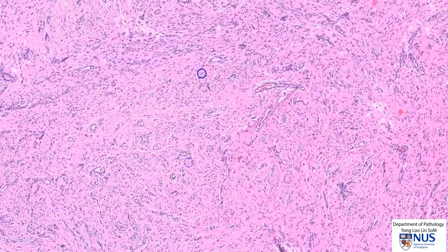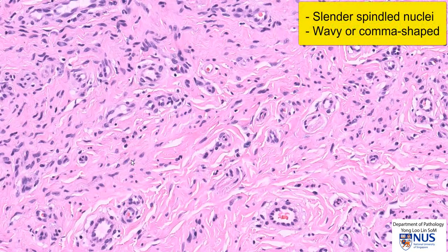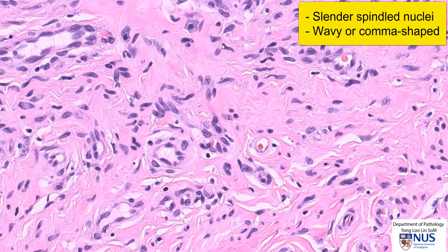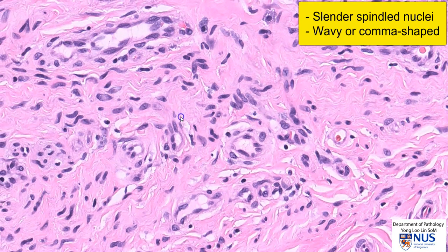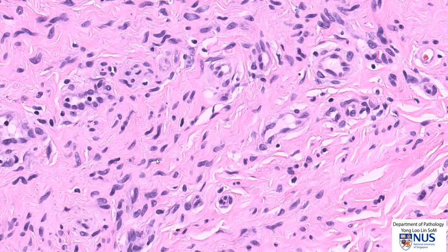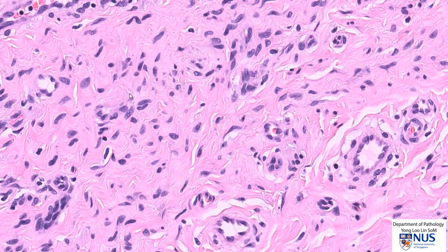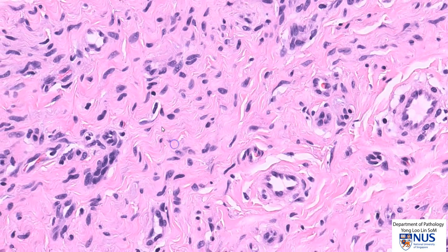The types of cells that we can see are spindle cells. These nuclei are quite elongated and quite slender. Some of them appear somewhat wavy, and some are actually almost comma-shaped. You can see a wavy nucleus here, and in general these nuclei have tapered or pointed ends. So we have spindle cells with wavy, slender nuclei.